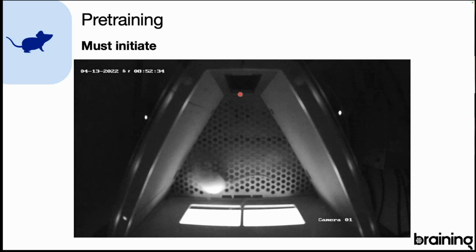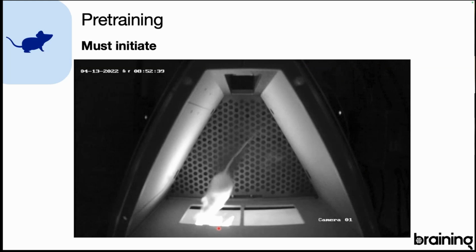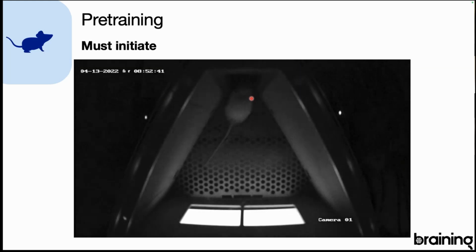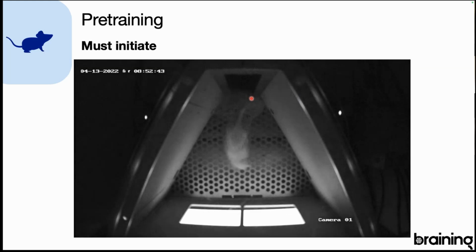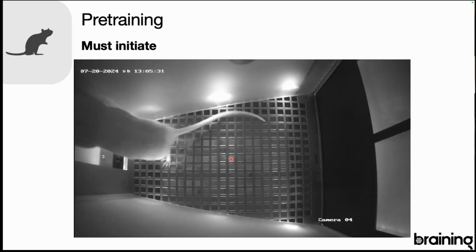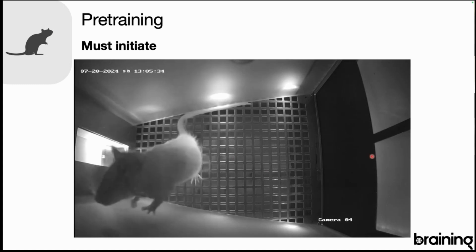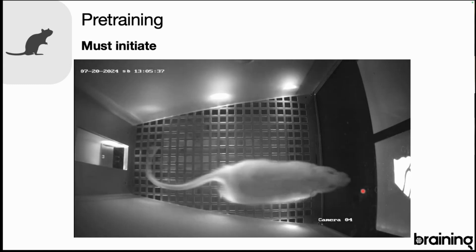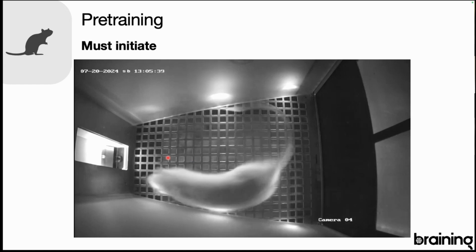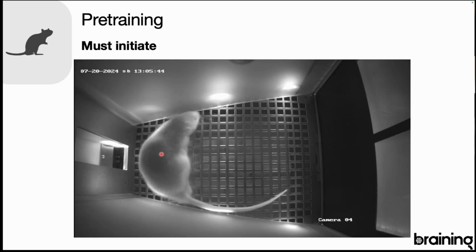In the case of the mice, it's a very quick response. Here you can see the animals need to start, the image is displayed, the animal chooses it and gets the reward for that. In the case of the rats, it's a similar procedure. To start the presentation of the stimulus on the touch screen, the rat needs to put its head here, the image is displayed, the rat selects it, and gets a single sugar pellet for that.